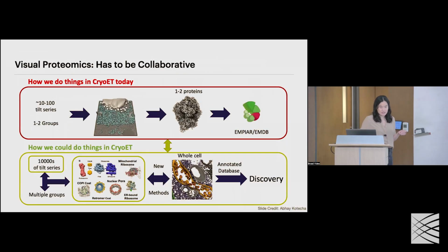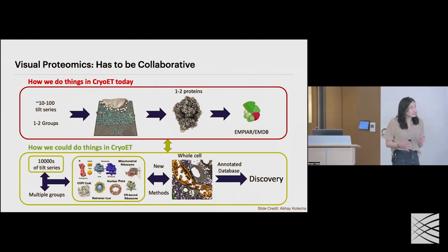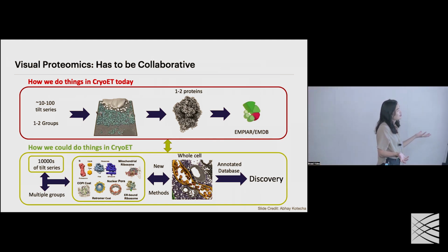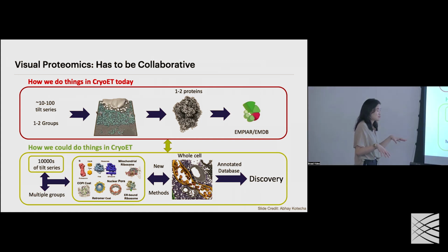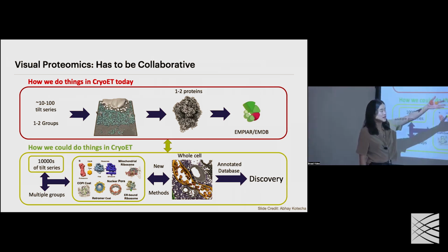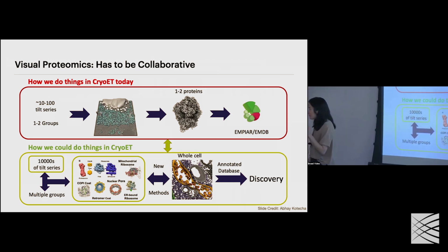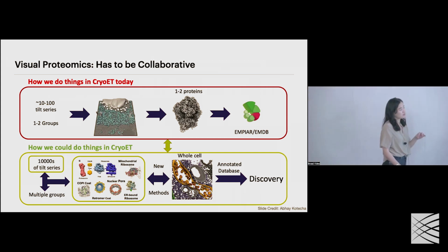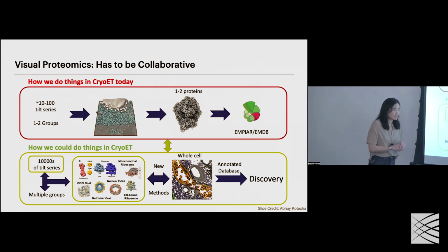This is a slide from my Thermo Fisher collaborator, although I think he's recently moved to St. Jude. Traditionally in structural biology, the analysis of data sets is done by the group. So each group will collect a data set, analyze it, and deposit it into the PDB. Cryo-ET data fundamentally breaks the paradigm, I think, of structural biology, in a couple of ways.